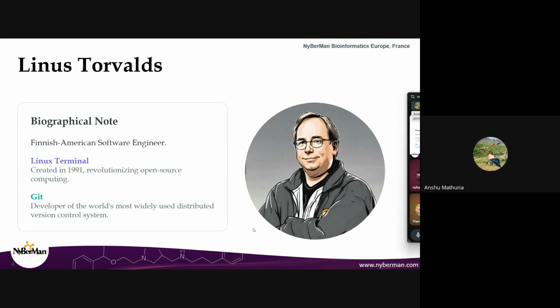Today, Linux powers most of the supercomputers, cloud servers, Android phones, scientific computing systems, and bioinformatics platforms. What is most important to us is the bioinformatics platform. As all of us are from a biology background, we are going to use the Linux OS for our bioinformatics systems. Whatever we do is going to be based on biology plus informatics. That is why we're going to use Linux for today's analysis, that is QIIME, so that we can understand which microbes are present. We'll run all the commands on Linux for the QIIME2 analysis.